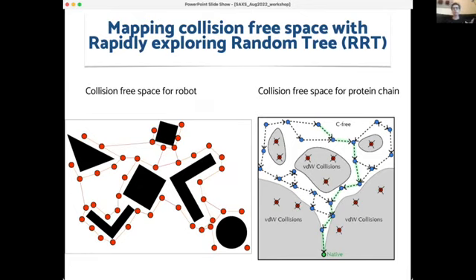This is not necessarily lowest energy minima or anything like that, but this can be done very, very fast. So if we want to sample interdomain motion using molecular dynamics that will go to the minima, it is really time consuming. Here we can sample quite a lot within minutes or maybe a couple of hours and generate quite a lot of conformations that cover the space very well.